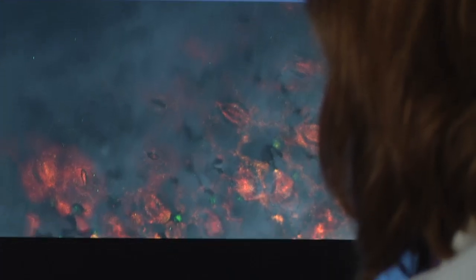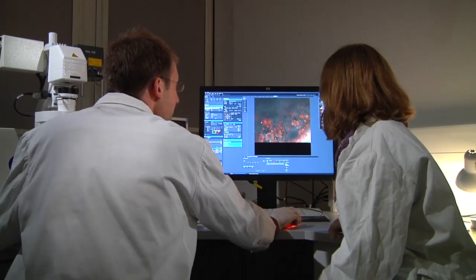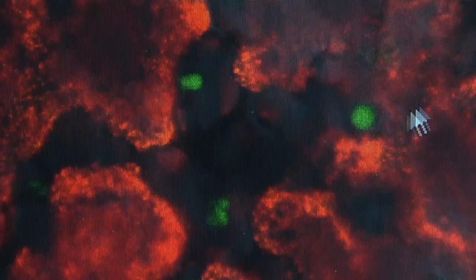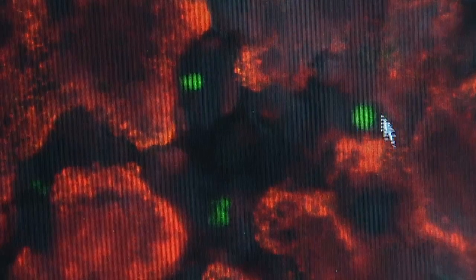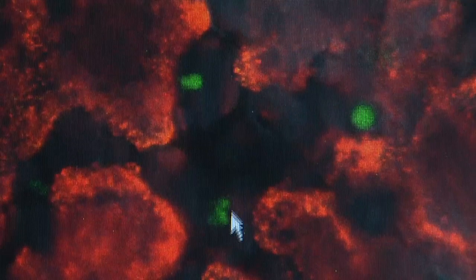Here, at the laser scanning microscope, I can show you what happened to the leaf discs that I transformed yesterday. I can already see something. You can see the red fluorescent dye of the agrobacterium. And what are the green dots? Those are the dyed cell nuclei of the plant cells. You mean the cell nuclei of the transformed plant cells? Yes, exactly.